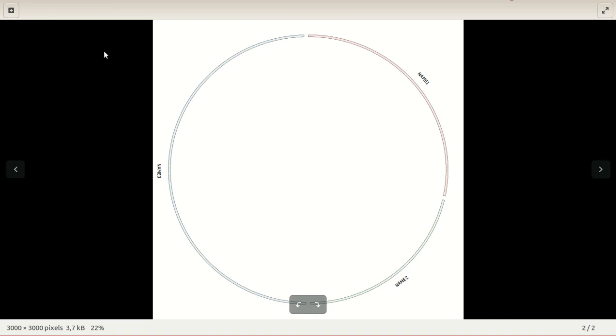This is the SVG file that actually shows the alpha channel better. That's going to be how transparent they are. So you can see that they are very transparent. And you have name 1, name 2, name 3, and these labels are parallel to the karyotypes, which are these nodes over here.